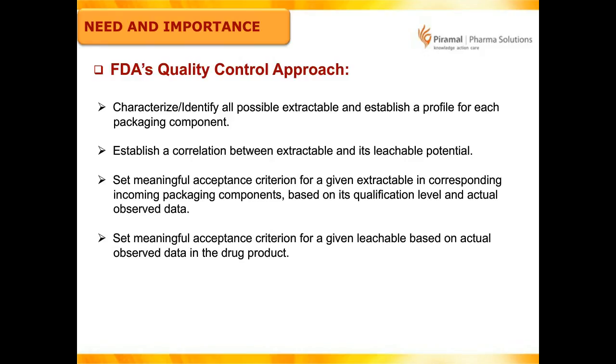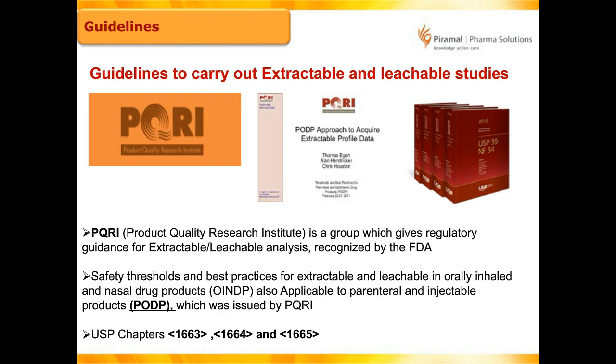So you need to monitor all those impurities which are crossing the AET limit in your leachable studies. To carry out E&L studies, there are guidelines available. The guidelines are PQRI guidelines, PODP guidelines, and there are USP chapters available.